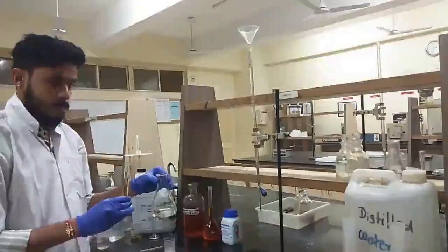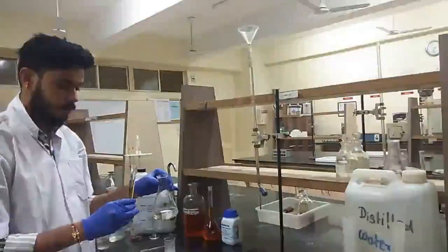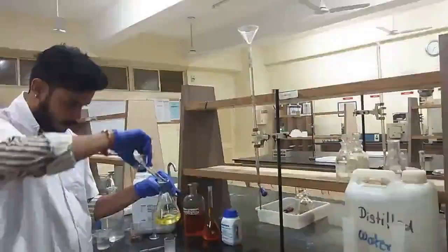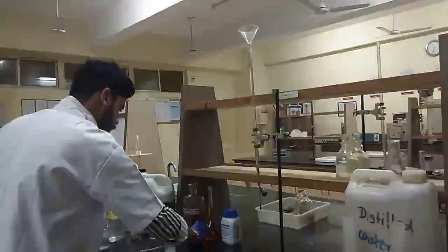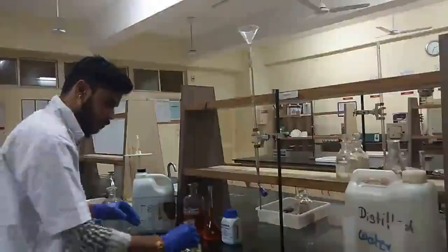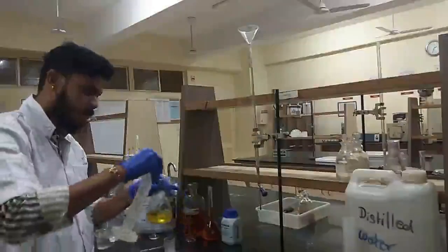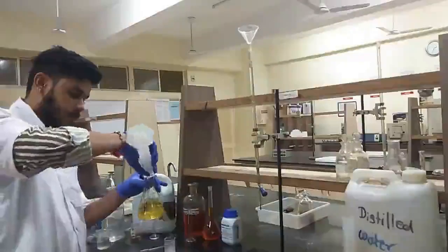So this we are going to add, that is 10 ml of 0.025 normal K2Cr2O7, in our conical flask. After this, we are going to add 100 ml of distilled water in it. So measure the distilled water properly in the measuring cylinder. We have already measured it, and we'll be adding 100 ml of distilled water into the conical flask.